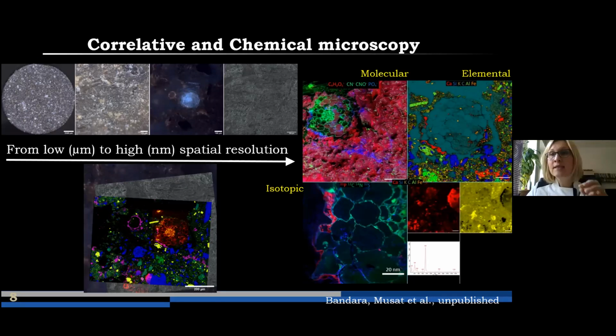It's collected as it is, undisturbed. So we try not to disturb any type of chemical gradients, because if we want to do chemical microscopy, we want to keep all the components and compartments in their place. Organic, inorganic, and microbes and roots and soil particles at the same time.